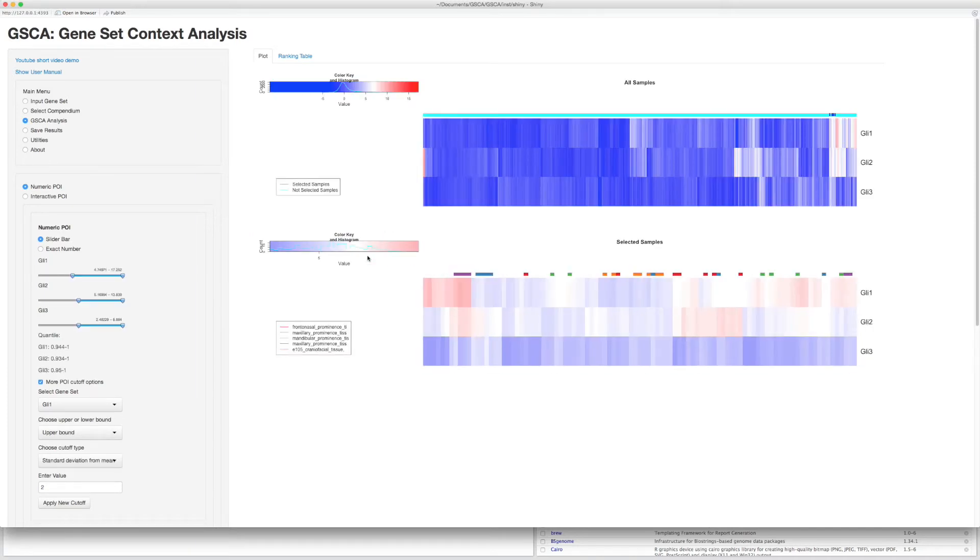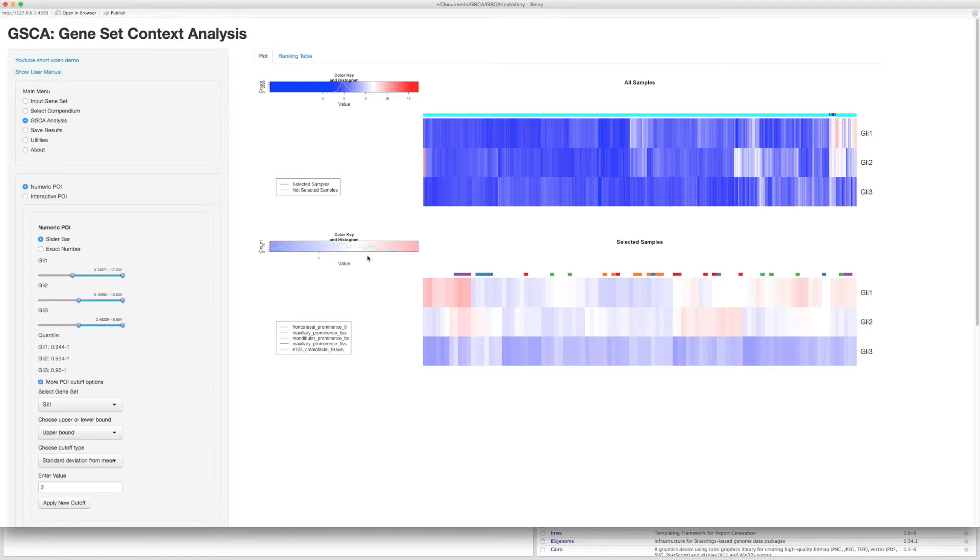For more than two gene sets, GSCA will display two heatmaps. In each heatmap, rows represent gene sets and columns represent different samples. The colors stand for high or low gene expression levels.